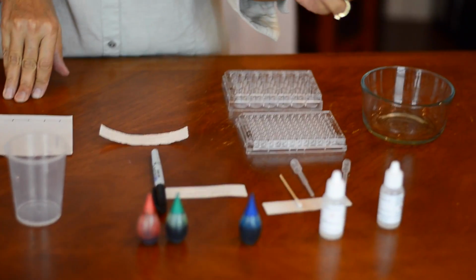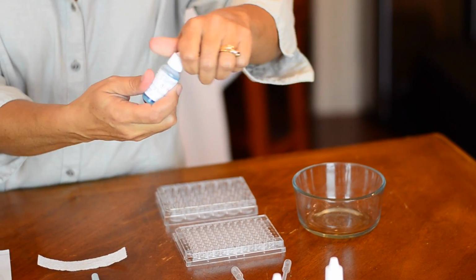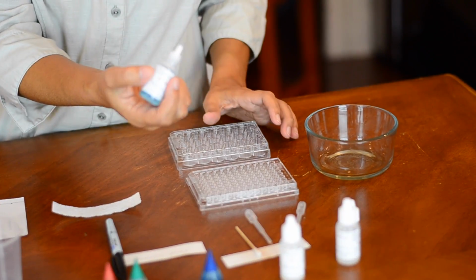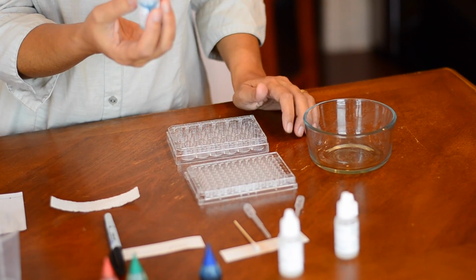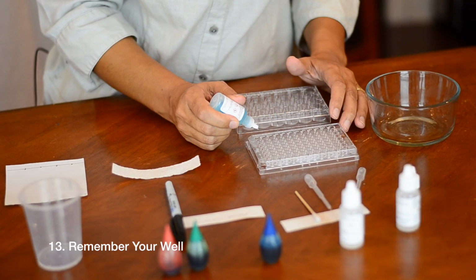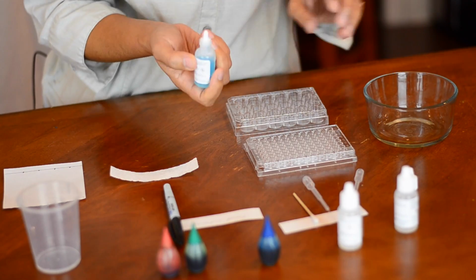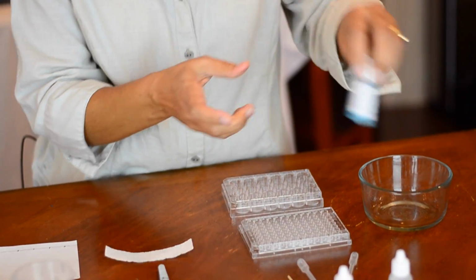It's time to get our reagents out. So the first thing we're going to do is take our copper nitrate. And I mentioned using pipettes for getting the copper nitrate solution out, but I've discovered that the dropper in the bottles is really quite a nice fine dropper. So I think if you're careful, you can squeeze quite easily 3 drops into a well. Make sure you take note of what well you use. I'm going to drop into H12 because I'm right-handed, and it's just a lot easier to aim for that lower right-hand bottom. So I'm going to put 3 drops right into the center of the well. Very nice to control, so no need for a mini pipette for that.